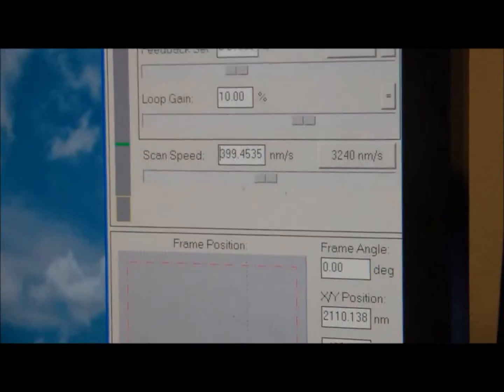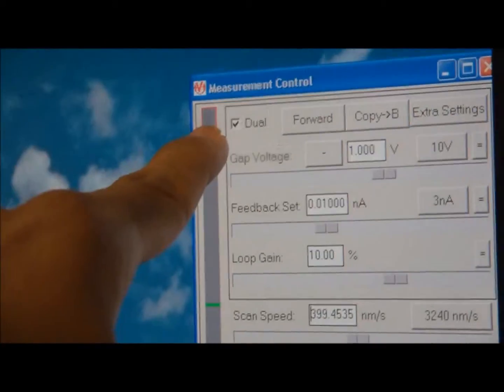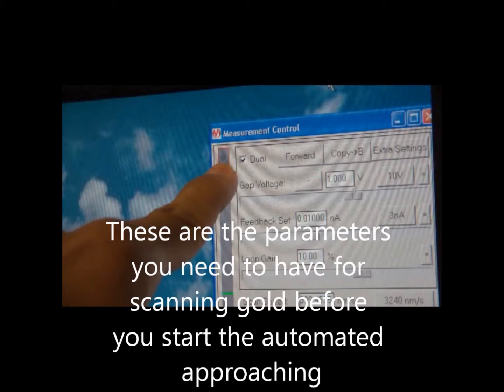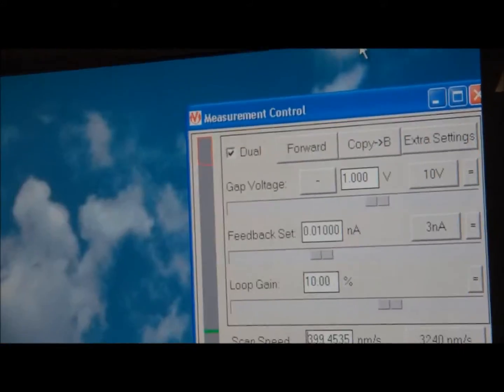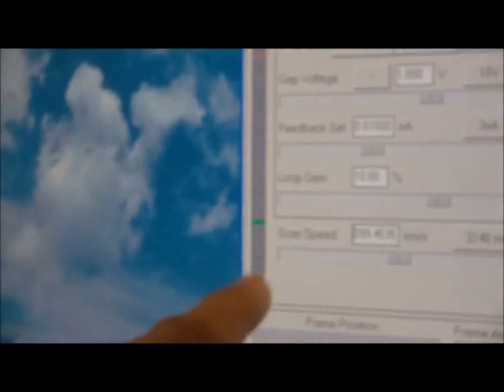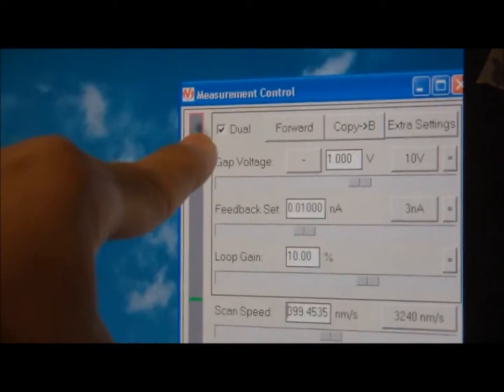This red region is when it's really, really close to the sample. This range right here represents the full extension and full retraction of the needle. The full retraction is right here, and the full extension is right here — the red region.